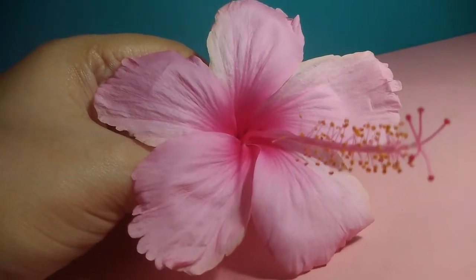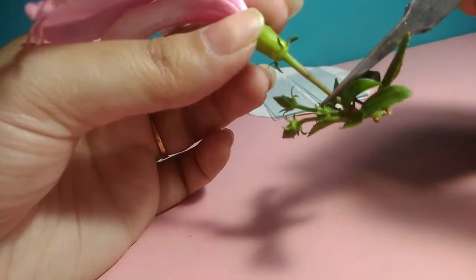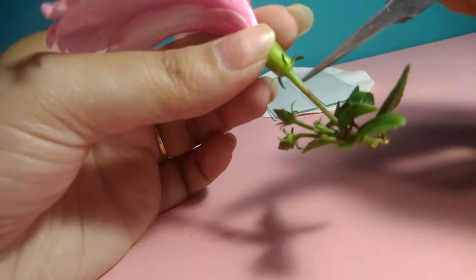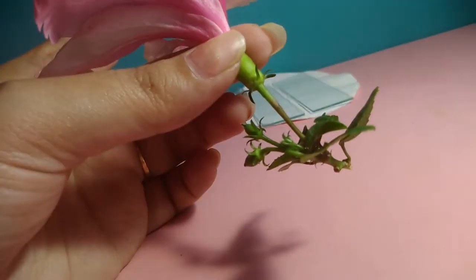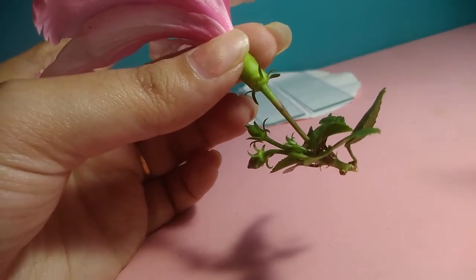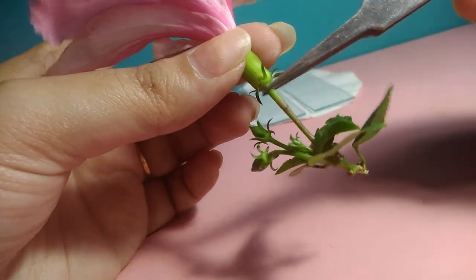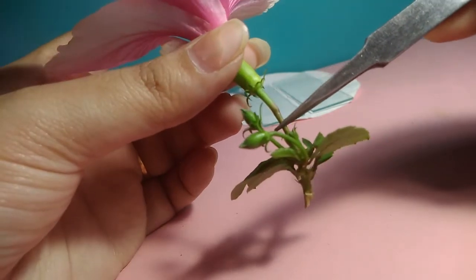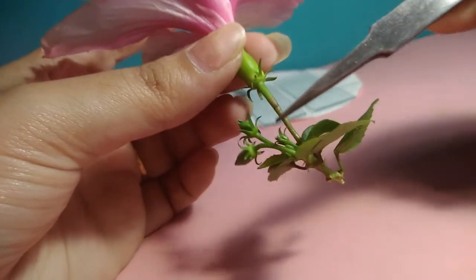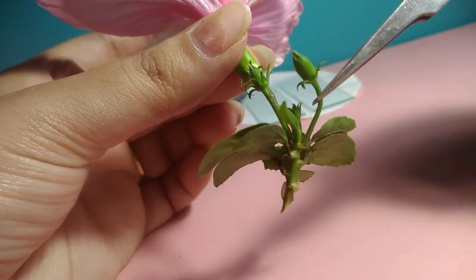So let us observe our flower carefully. Now this stalk which joins the flower to the stem or to the branch of the plant is known as the pedicel. This stalk-like structure is known as the pedicel of the flower. With the help of this pedicel, the flower remains attached to the branch or to the stem of the plant. And you can see that here are small buds as well, flower buds.